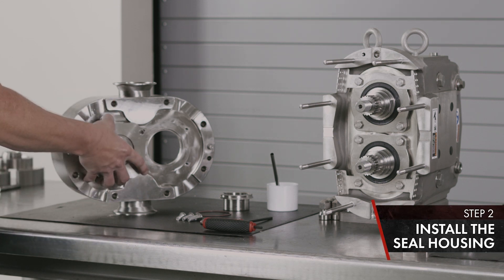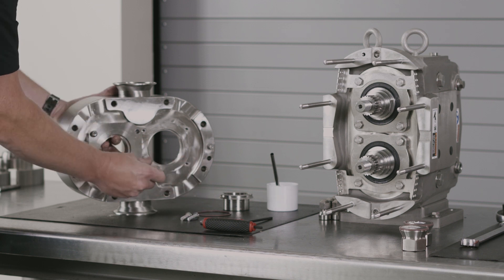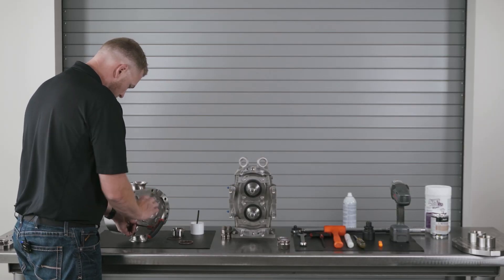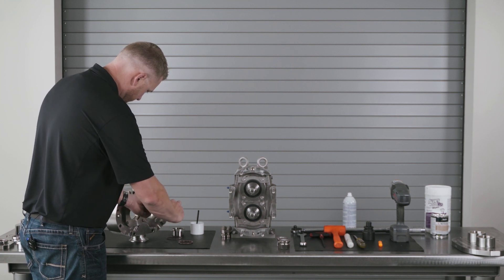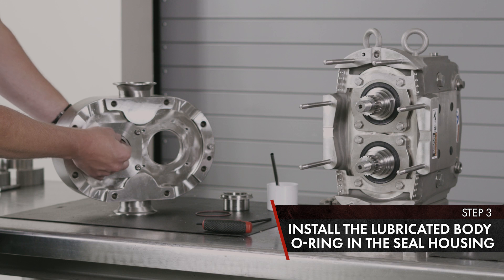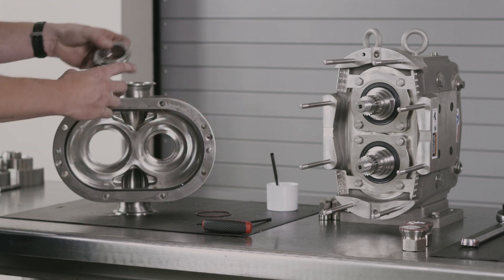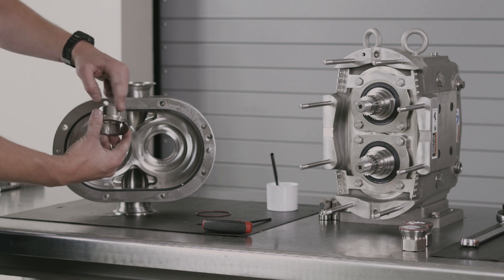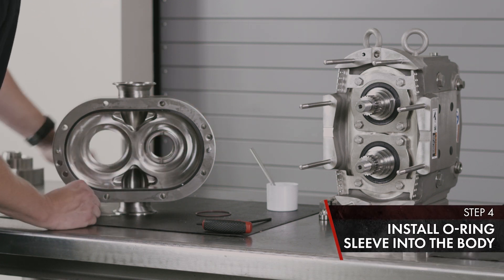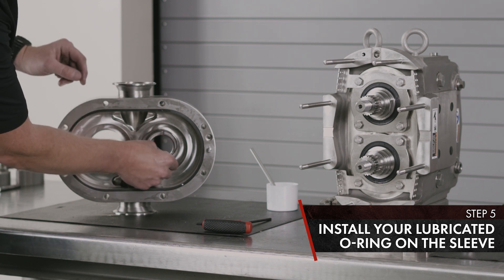Take your seal housing and align with the bolt holes. Tighten the bolts using your 3/16ths Allen wrench, hand tight. On the inside of your seal housing, use your body O-ring — install in place and lubricate. The Universal 3 has a front-loading single O-ring sleeve; apply lubricant around the outside and install through your body O-ring. The final O-ring goes from your single O-ring sleeve to the backside of your rotor — lubricate and install on your sleeve.